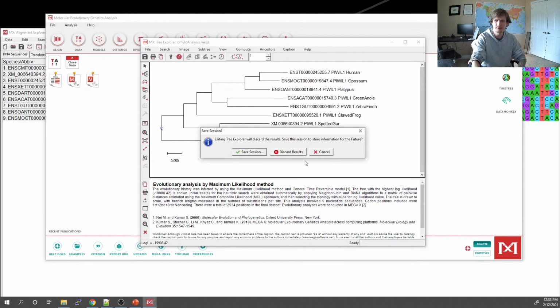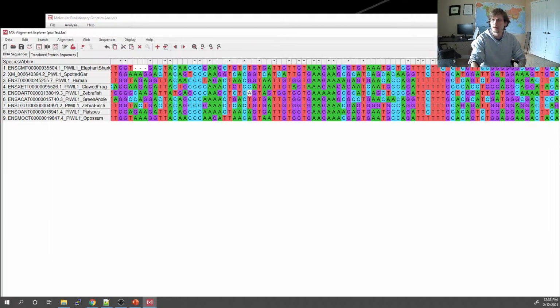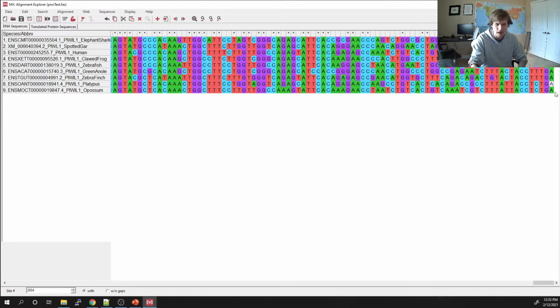So I'm going to close this real quick. Okay, and so whenever we bootstrap, this is our data. A bootstrap is really not that common of a statistics test. But if we have low sample size, we may bootstrap our data to build support in it. And so in bootstrapping in phylogenetics, we have this whole alignment, right? This alignment is 2,900 bases long, or 2,900 positions long.